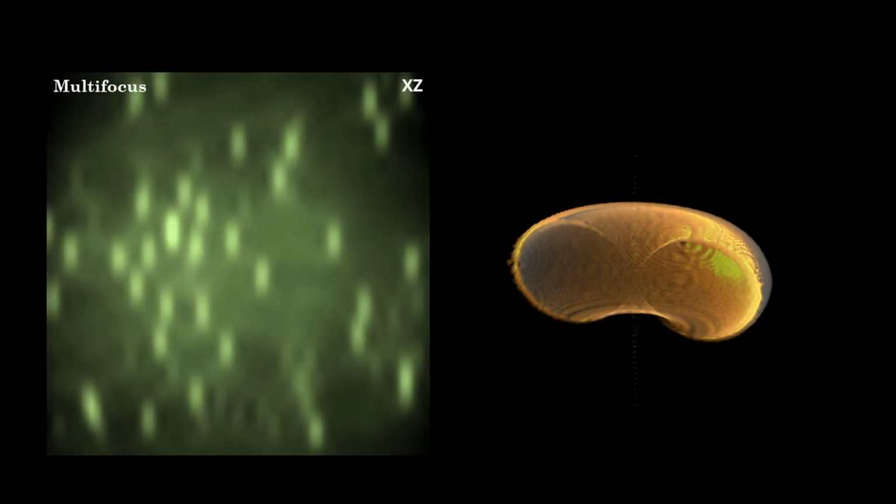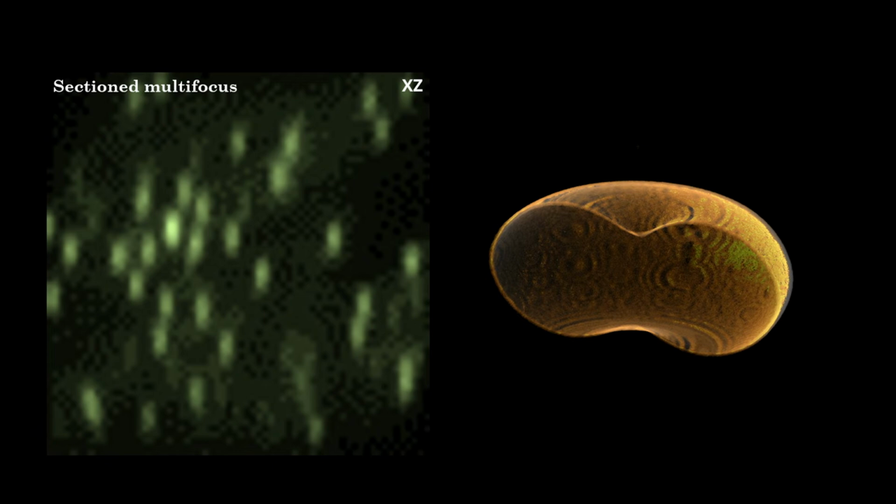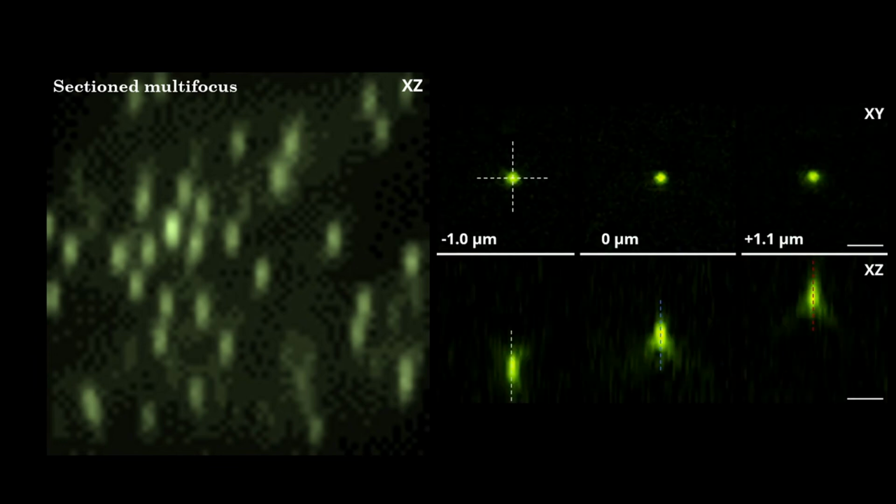When we do simulations on this technique, this is regular wide field microscopy. This is a cut through the optical transfer function. And by using this technique of using a tilted light sheet and synchronized readout with the camera, then we actually get a much higher resolution along Z and basically a rejection of all the out-of-focus light. It works in real life as well.